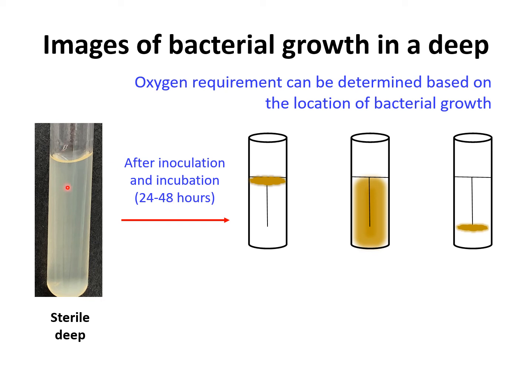Okay, now remember the deep? We talked about the deep and we said that it's a semi-solid, so it does have agar, but not a lot, so that's why it's a semi-solid type of medium. And we said that if you want to inoculate your deep, we use a needle. And as I said, you literally stab the needle down into your deep.